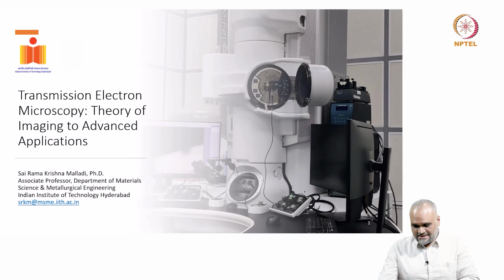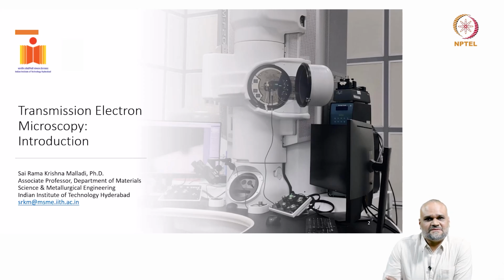So with this, let me just go to the very first lecture of today, which is on basic introduction to transmission electron microscopy. Now, we all know microscopy is a very important area across various fields of research, be it physical sciences, chemical sciences, biological sciences, material science. Everywhere you use microscopy as a tool of characterization.